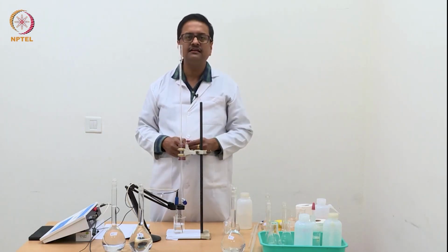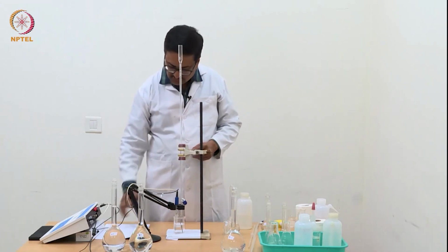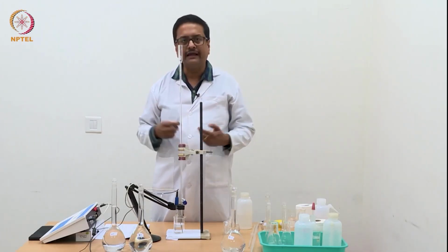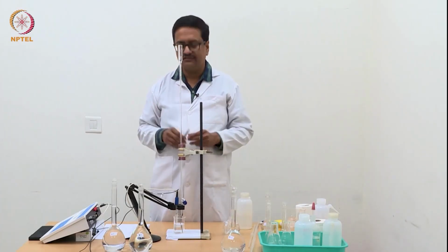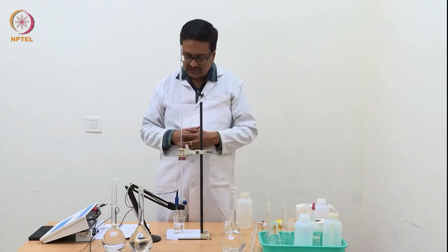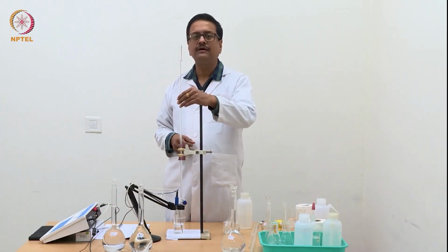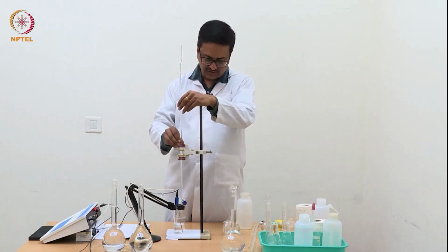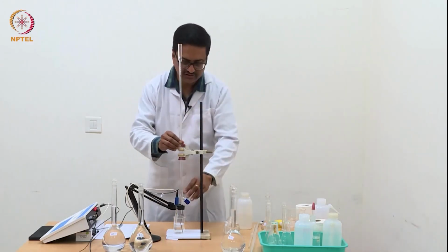As we have done in the case of strong acid versus strong base, we should continue this titration till the pH reaches 9, 10 or more than 10, and we reach again a flat region when the pH will not change significantly with addition of more and more NaOH. Then only we will be able to draw the proper S-type curve for the pH versus volume of NaOH titration.